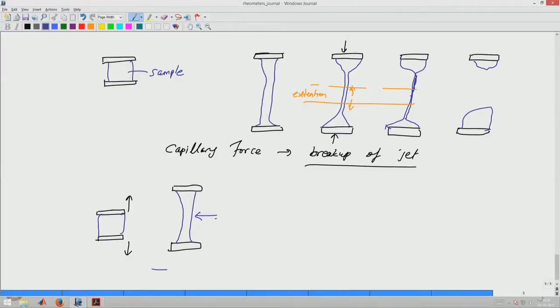Therefore, you need to do measurements and improve, because remember you are doing this for a sample whose behavior you do not know. And so, the instrument has to do something and then try to figure out whether it is doing it correctly through your inputs. Then you have to try to change the conditions at which you are doing it and measure appropriately, and then maybe change the rates at which the plates are being pulled apart and so on. And of course, the jet or the thread which is being formed has to remain stable over the measurement period. But again the force which is required to pull in this direction and the strain rate which is achieved could be used to again do the measurements in this case also.